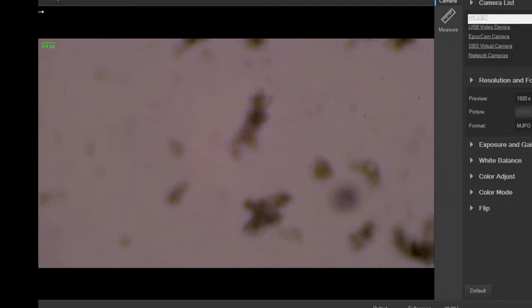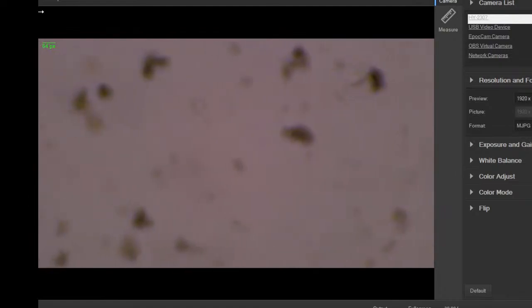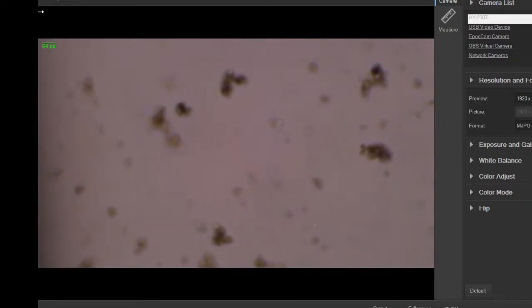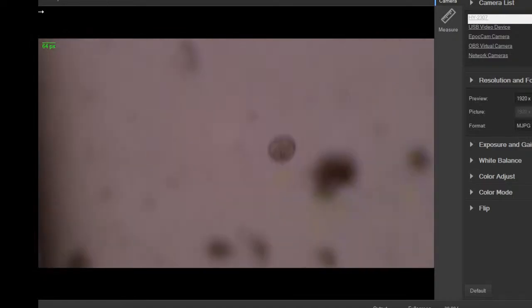But see the jerky movement they have. It's kind of bopping back and forth. If they feel irritated, it's like a defense thing. They'll pop around like that. And when they're on a stalk, the stalk will retract like a little coil, like a bed spring. But seeing them swimming free like this is interesting. Never see this. They have a ring of cilia near this kind of an oral opening thing, and it's using that plus some other cilia to move around.